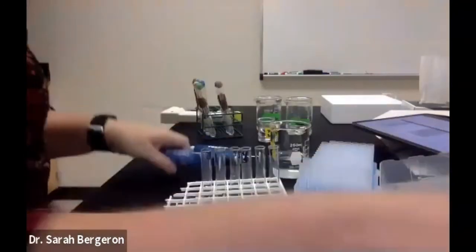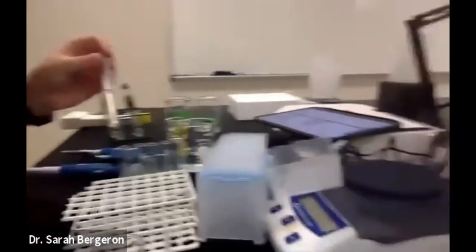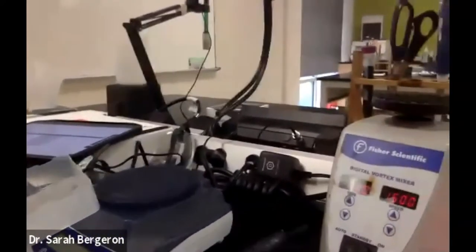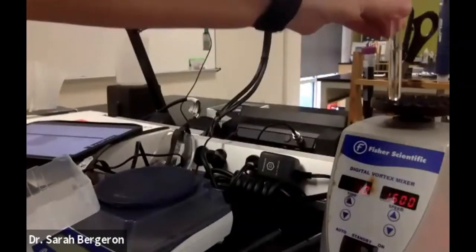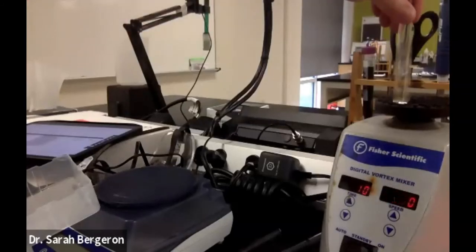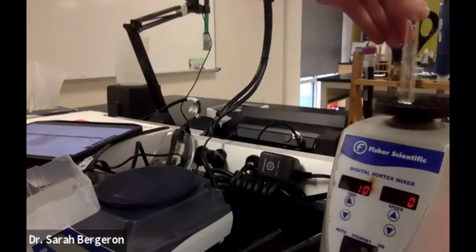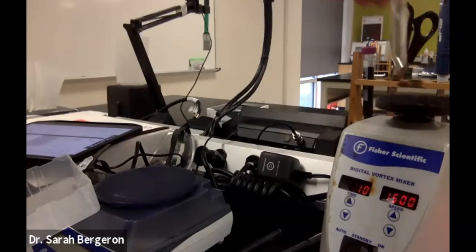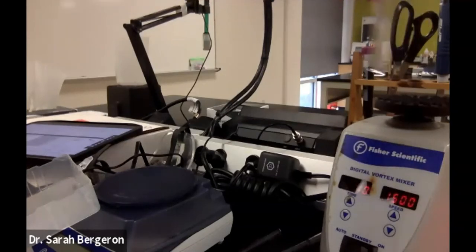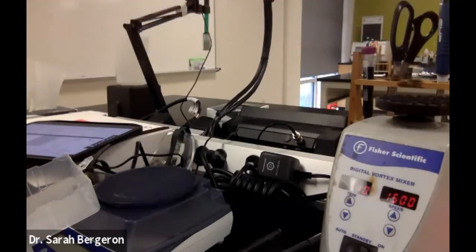Okay. All right, so now I kind of want to mix them up. I don't know if you can see the vortex there. It's hard for me to see what y'all can see, right? Give it a good mix there. Then we need to prep our samples.